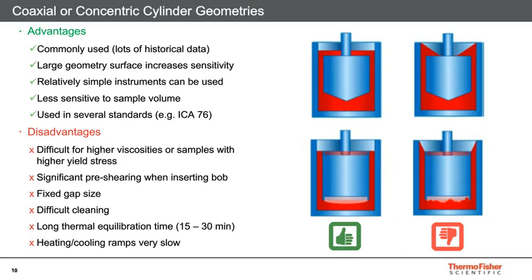The geometries of this type of setup, say the diameter and height of your inner and outer cylinders, are predefined, so you can't change the gap spacing or the dimensions between your inner and outer bob.